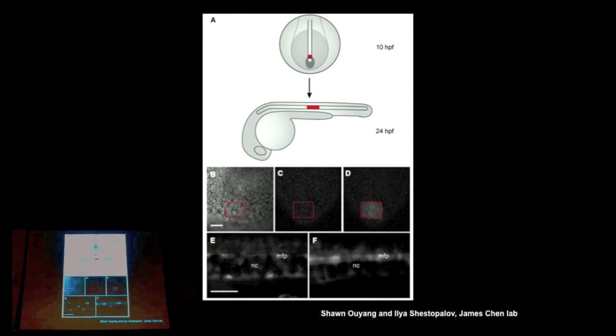Thanks. I think one point though is that between UV and 2 photon, the size of the point spread function of any objective, like in that equation for NA, also involved the wavelength, so with a shorter wavelength light and the same NA, you're going to get a tighter spot than with a longer wavelength light. And it's typically linear. But in 2 photon, is it the square?